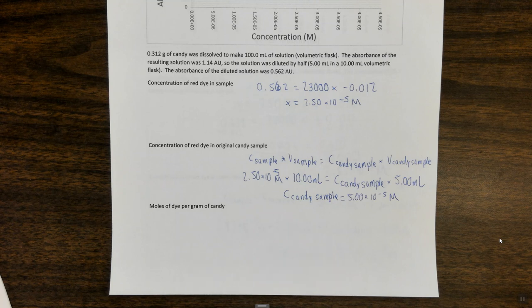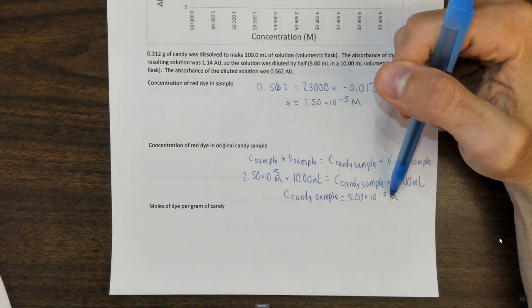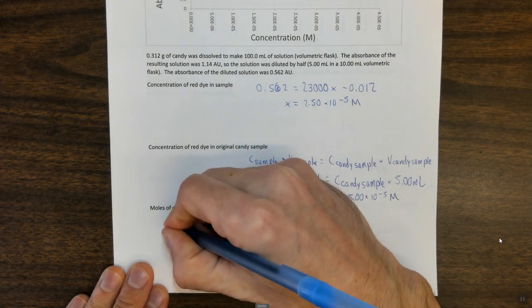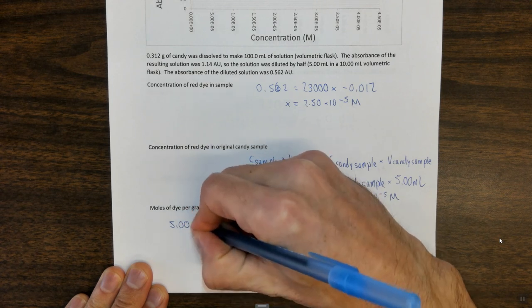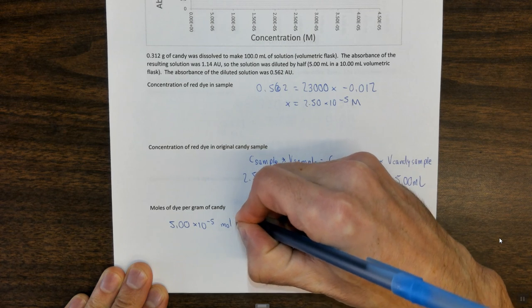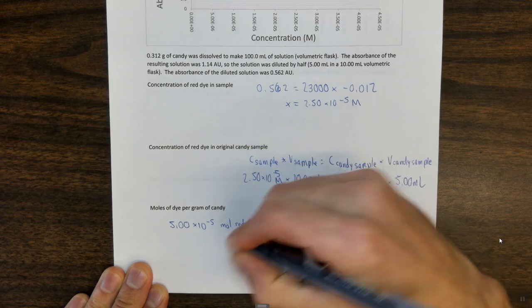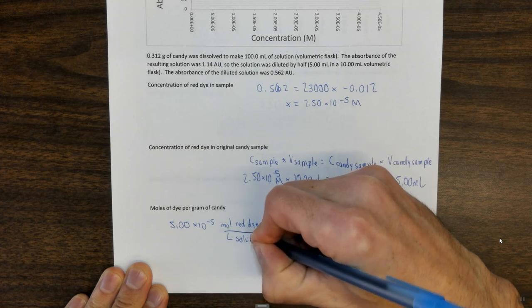So the first thing is I have the molarity of the candy sample. What this means is there's 5.00 times 10 to the minus 5 moles of, in my case, red dye per liter of solution.